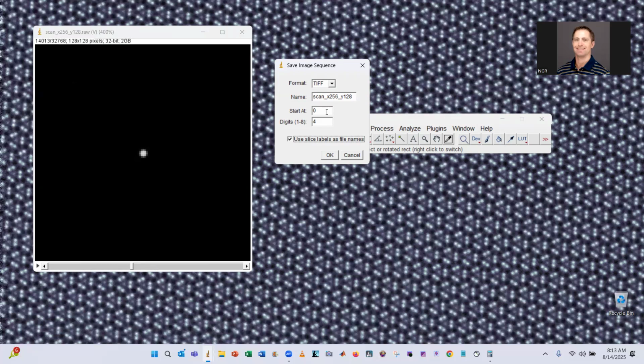And then you want to probably start at 1. And then we have 30,000, so I would use, say, 5 digits. You can put an underscore at the end of this as well, and then it will export them.